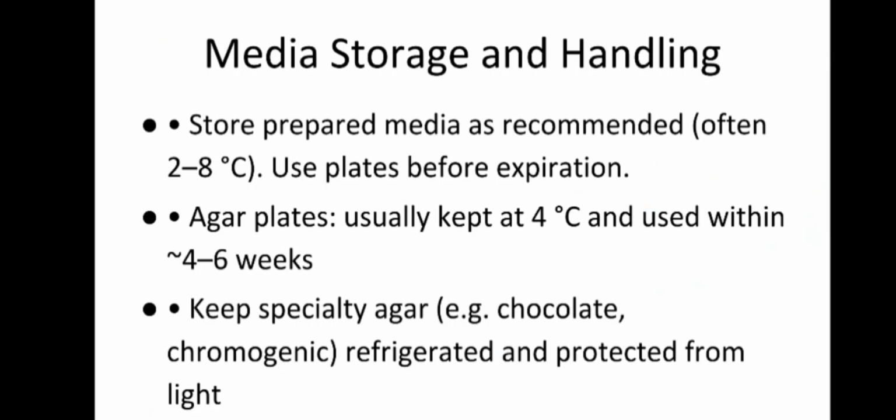Okay, moving on, media storage and handling. So each type of plate that we get has a purpose and specification of storage. So store prepared media as recommended, often at 2 to 8 degrees Celsius, and the same for purchased plates, if you're not making them on your own, which is a common practice.